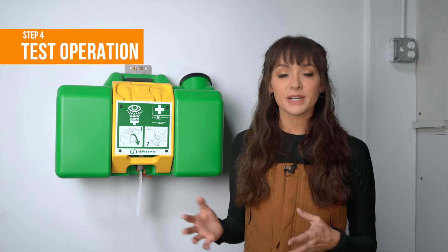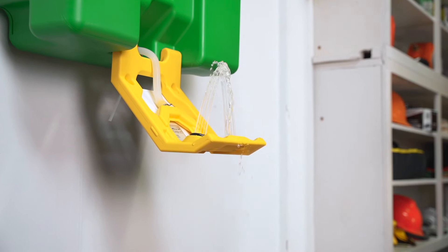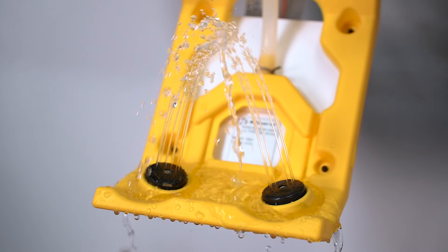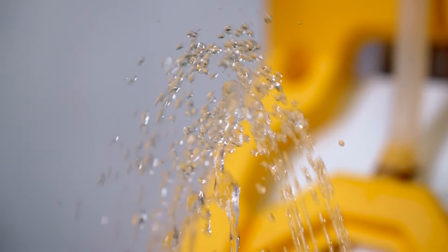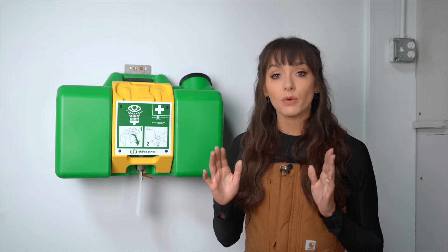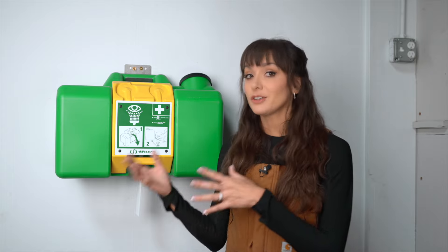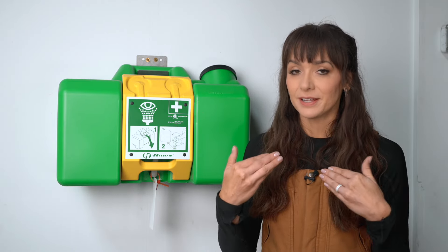Next, test the operation. With most self-contained eyewash stations, they aren't set up to be activated without draining the fluid. But if your model allows you to check it, activate the eyewash station and observe the water flow — it should be steady and strong, with both eyewash nozzles functioning properly. If your model doesn't allow it to be checked, just make sure the water or solution is full, clear, and the right temperature. The water should be tepid — not too hot or too cold — a temperature you'd actually be okay flushing your eyes with.